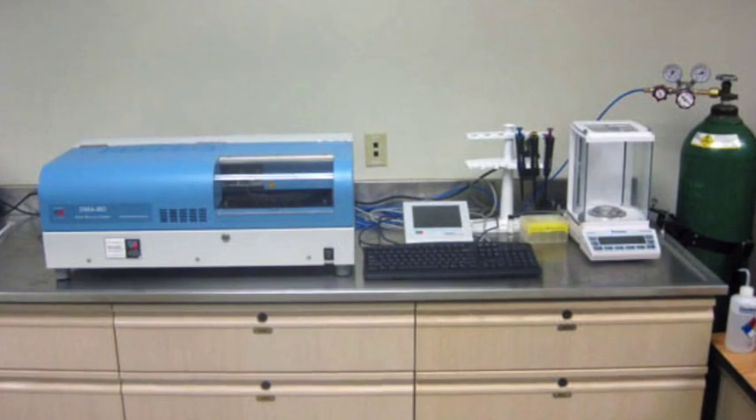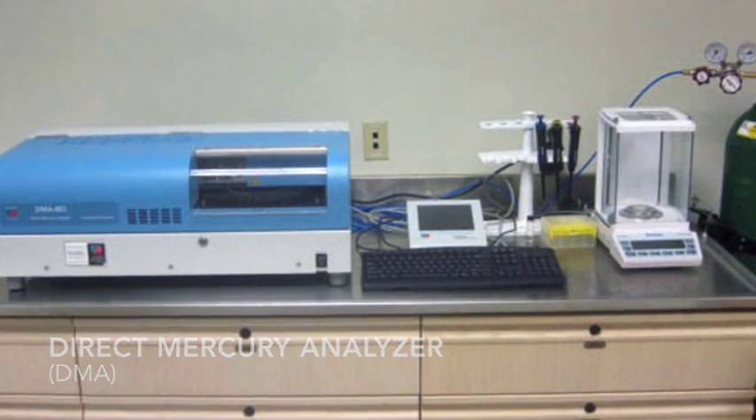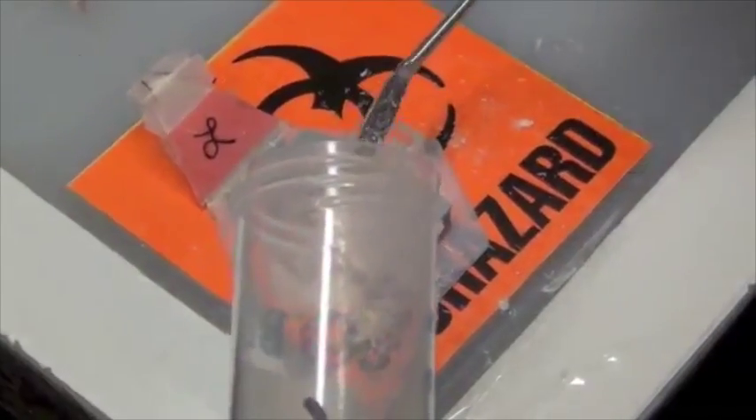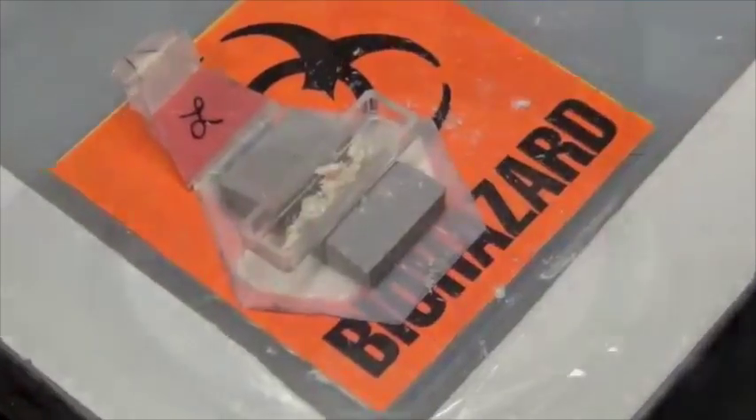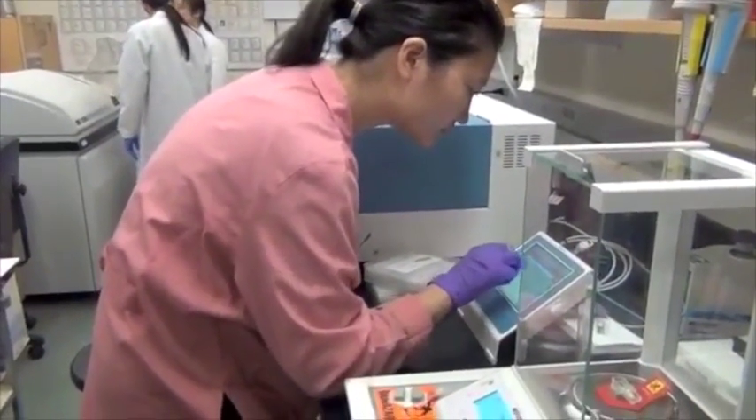We use a direct mercury analyzer, or DMA, that analyzes the total amount of mercury in tissues directly. We weigh out each sample into a sampling boat and enter the weight into the DMA, and the machine will use it to calculate the concentration of mercury in the sample.